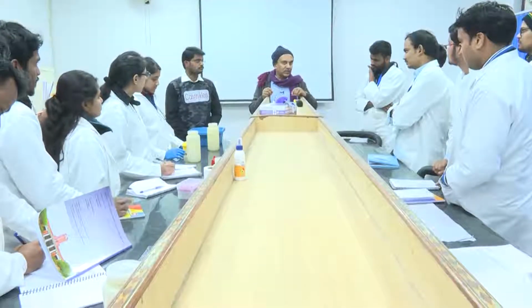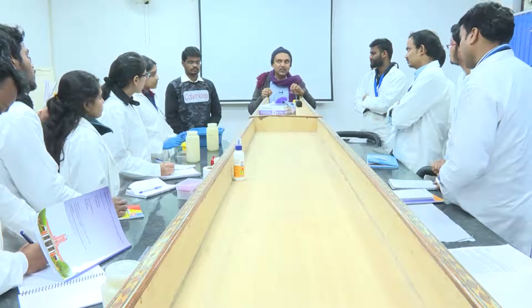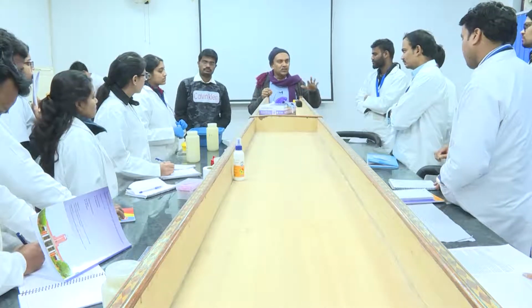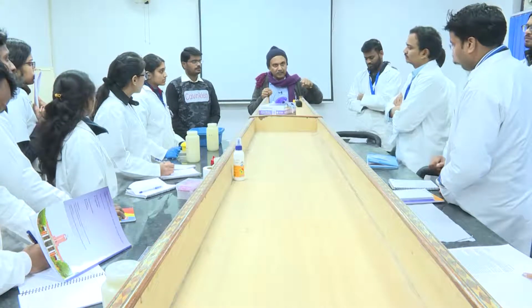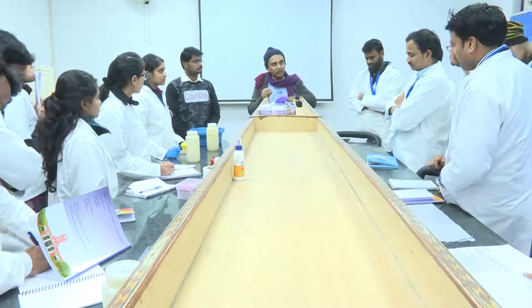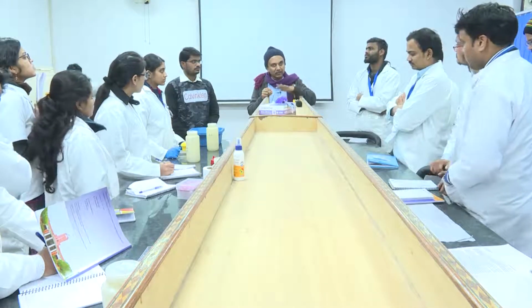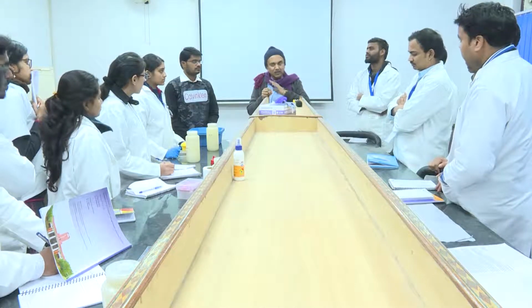After you extract them, you again use another kit to remove the inhibitors, because in soil you have so many inhibitors, like polyphenols, humic acid, and so many other things. They will inhibit the PCR reaction. So after extracting the DNA from your sample, you use the purification kit to purify them, or you run a PCR reaction to find out whether you have any inhibition of the reaction, then you go for the other real-time analysis.